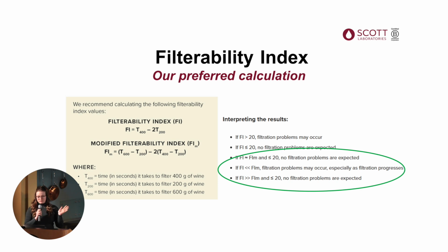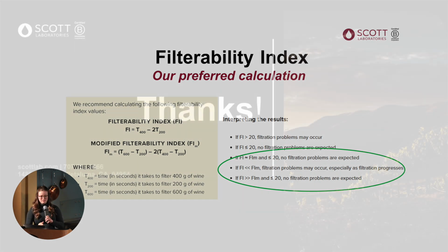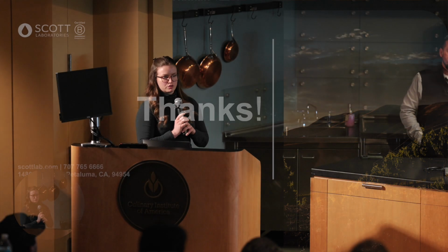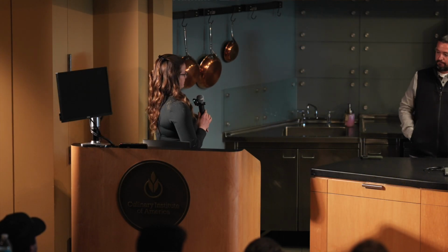So again, don't worry about remembering any of these values or anything like that. You can always contact any of us later to talk more about the nerdiness of filterability. So I'm going to invite Daniel up here, and he's going to talk and show you a filterability test and then also talk about some potential results that you could see.